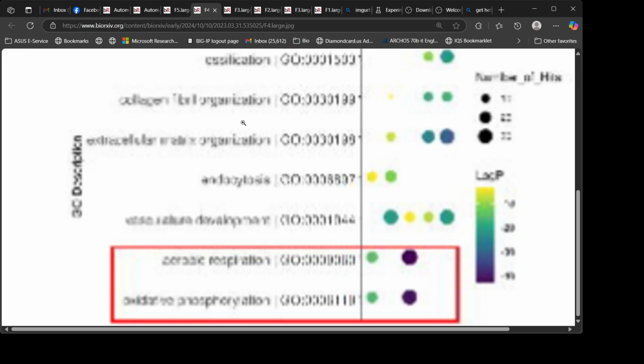However, upregulation of aerobic metabolism in certain clusters remained constant, demonstrating a consistent association with the tumor phenotype across all patients, Figure 3 and Figure 4D. Processing and visualization of multiple patient samples through VR-Omics facilitated the discovery of similar cell populations and molecular signatures in MCTHB302 and MCHTB361 that suggest they are characteristic of CRMS, Fig 3-5, and supplementary Figure 9.